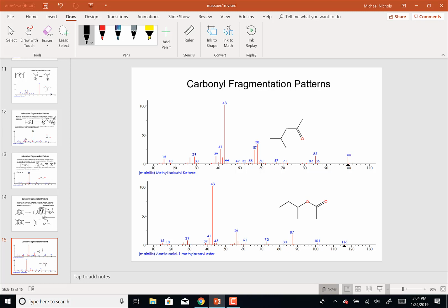The thing that's not easy about it is I've got very few 87s to work with. And then when we smash them, I've got even fewer. And then if you want to choose one of those and smash it, you're down to detecting like 4 ions. You've lost all your ions basically. You keep taking out the wrong ones. So I think that's the problem. I got it down to where I can't see anything.